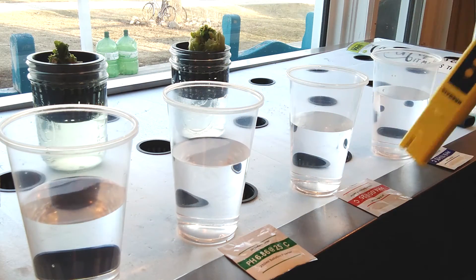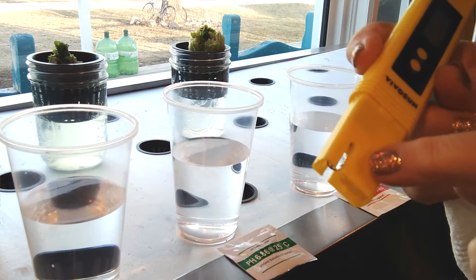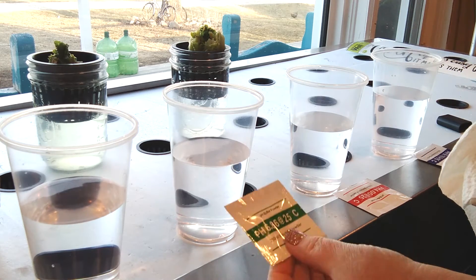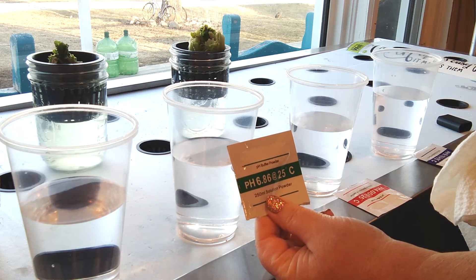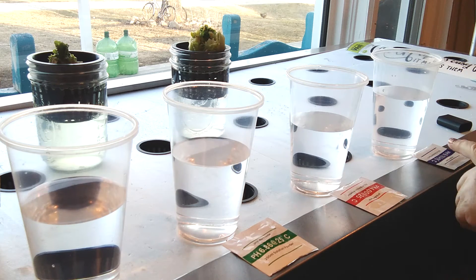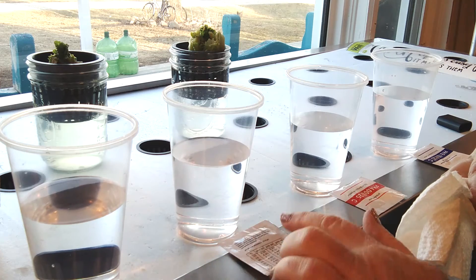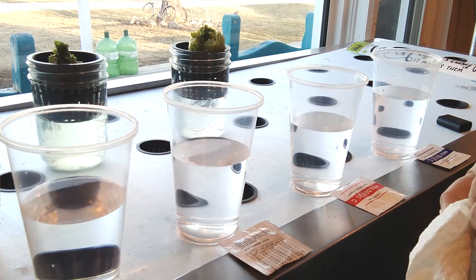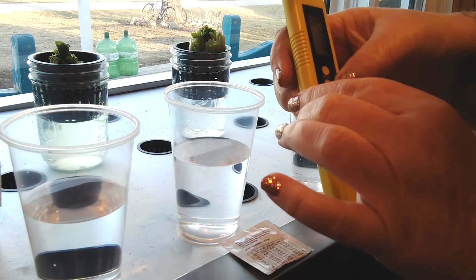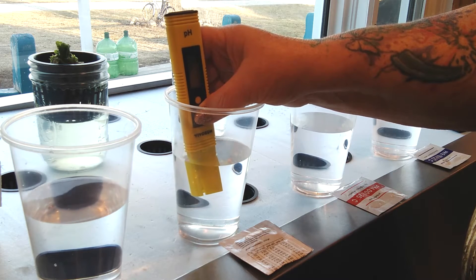To calibrate our pH monitor, we're going to remove the end cap and set that aside. We want to turn our unit on and put it in our distilled water just to rinse it off. After we dip it in, we're just going to lightly dry it — we do not want to dry where this testing element is, just the outside lightly. You want to start out with the 6.86 solution first: it goes 6.86, then 4.00, then 9.18. Keep in mind we're using this at a different temperature so we're going to have to use the conversion chart.